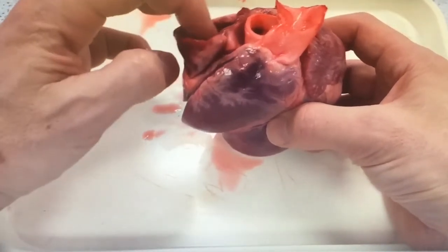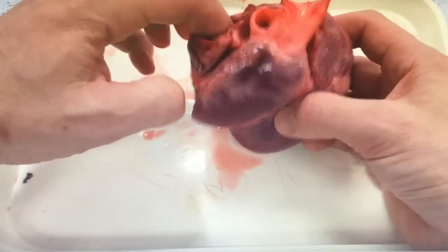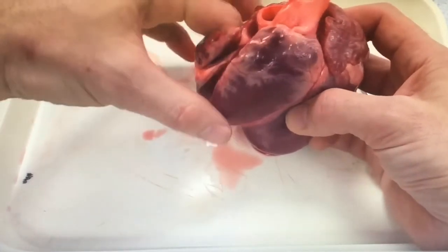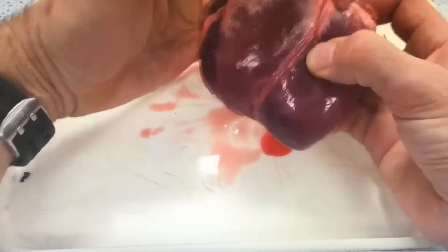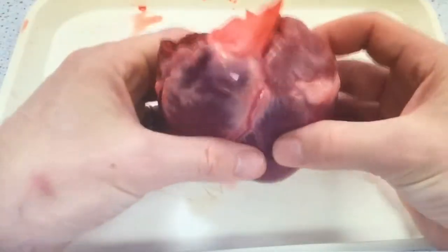The best way to navigate your way around the heart is to stick your finger in and see where it actually goes. Push your finger down and you'll go through the right atria into the right ventricle through the tricuspid valve, and as you squash the wall of the heart you'll see your finger pushing against it.